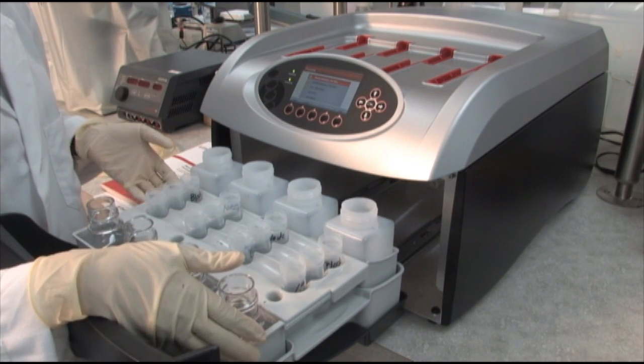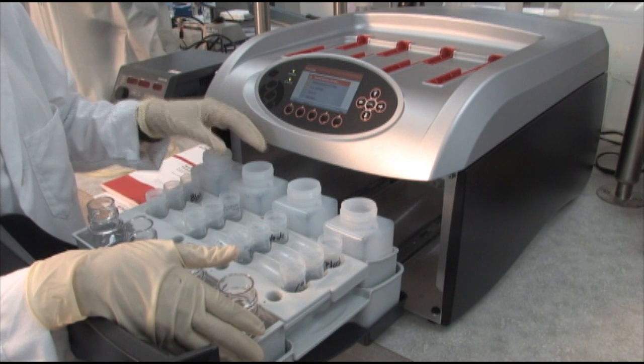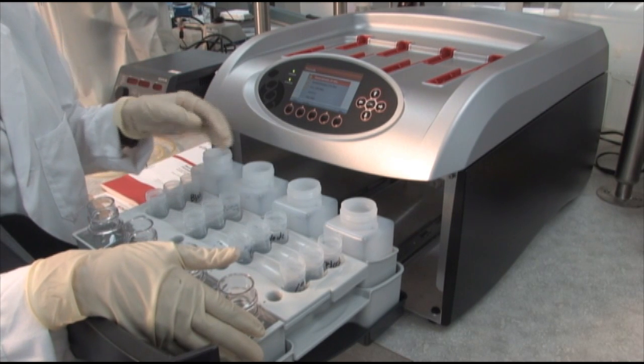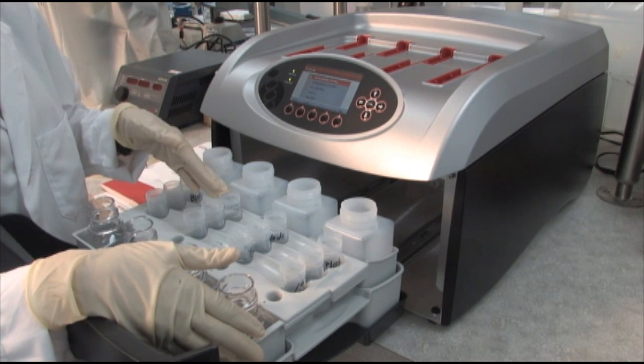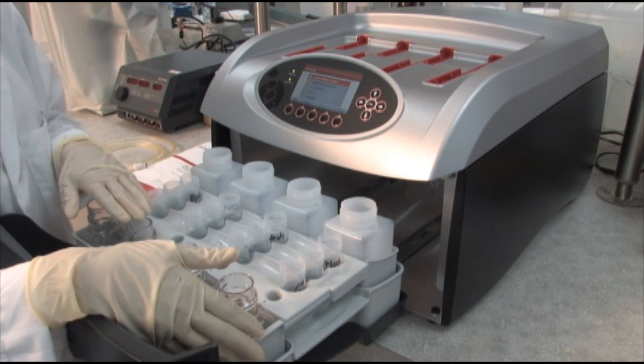The reagent tray inside the drawer has bottles and vials for various solutions that are clearly labeled. These bottles are for the wash solution. Then we have vials for the blocking solution, primary antibody, secondary antibody, and the rinse solution.